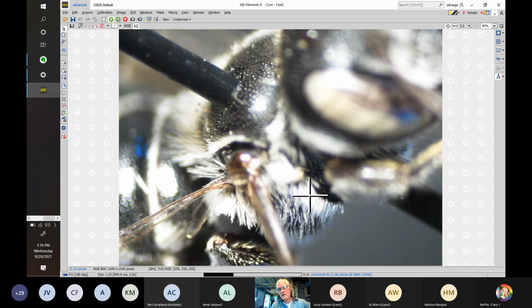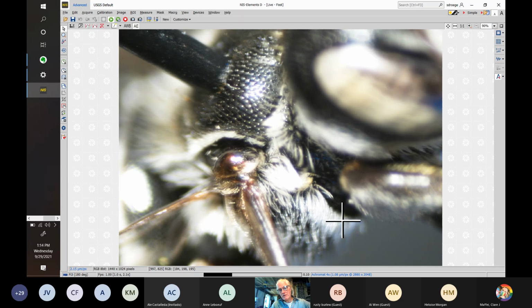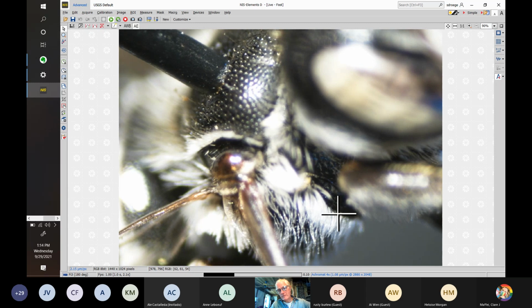This, although hard to see here, maybe I can go all the way up in terms of power. Yeah, it doesn't really resolve well, but there's a raised line along here. You're seeing all this hair on the lateral face and no hair on the front face. This is often the case. Part of what's going on is these legs can tuck up into there.